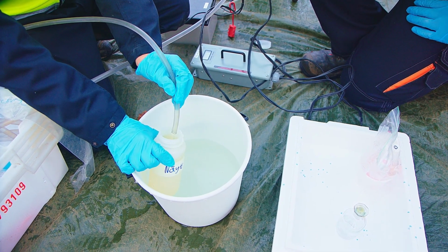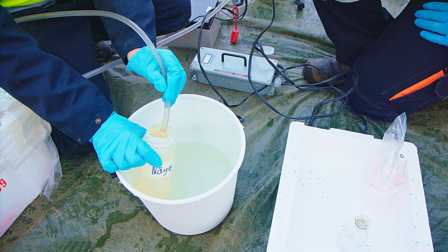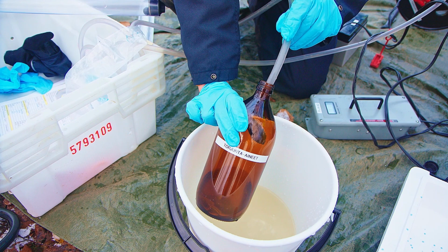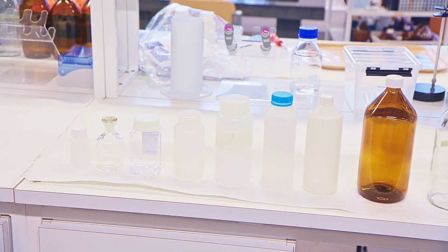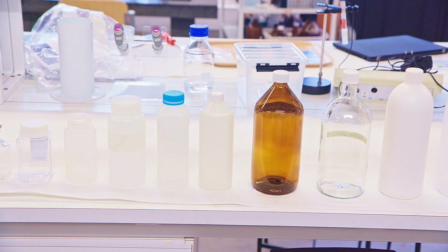Bottles are usually filled so that several times more water than the volume of the bottle is allowed to flow into the bottle. This rinses the sample bottle during sampling. If the bottles have been pre-processed or chemicals have been added in them beforehand, they are not rinsed. The type of sample bottle depends on how the samples will be analyzed. The bottles should always be filled according to the instructions given by the laboratory.